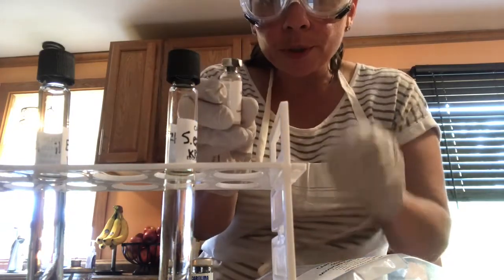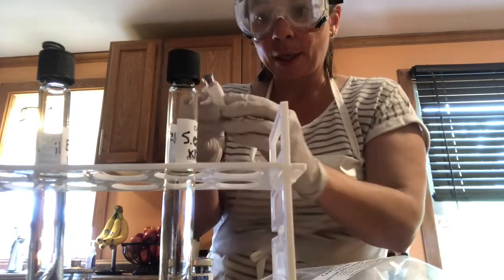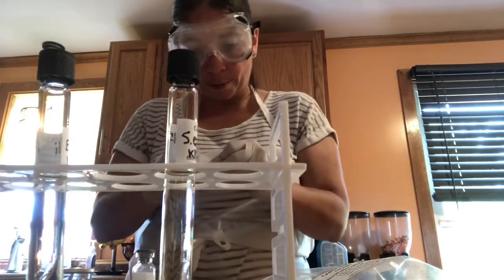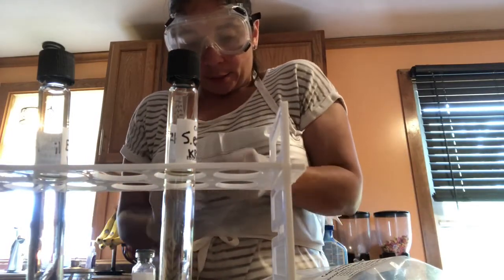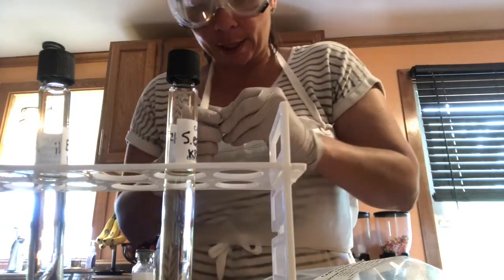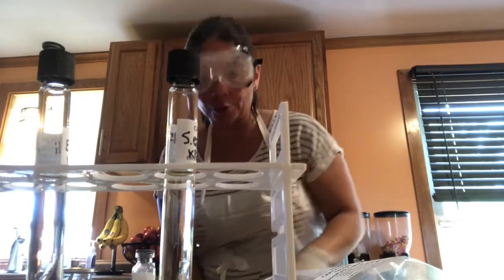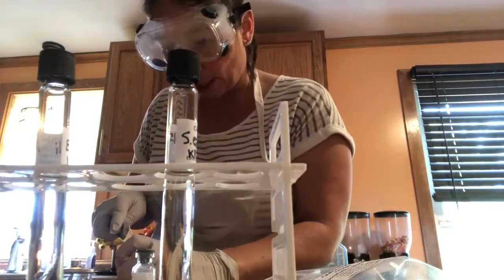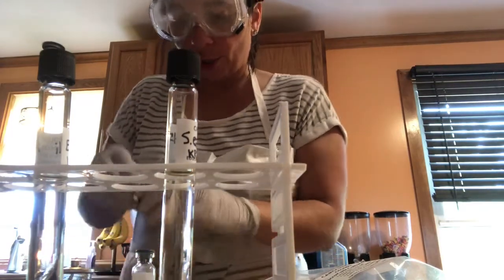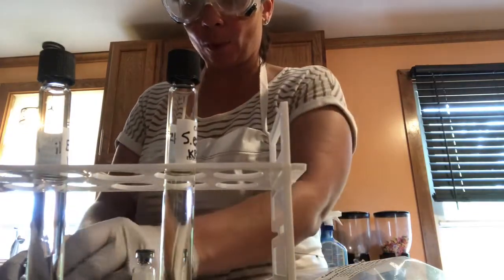So you want to open it so that you tear the metal, and then you're going to just open that up. So here's my E. coli. I'm going to set it down here. I'm going to open up my staph here. And of course that one did not break as intended, so I'm going to have to use a butter knife like before. Just be super careful when you're opening these. And obviously whatever tool, like a knife, that you're using, you're going to have to wash it thoroughly or throw it out. Okay, so I have my staph epi open.